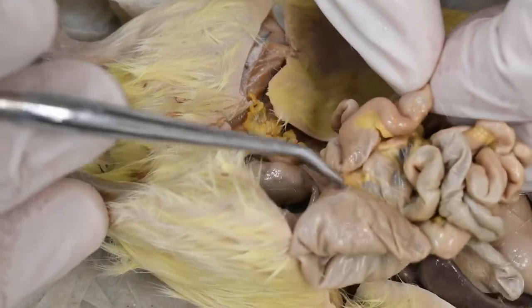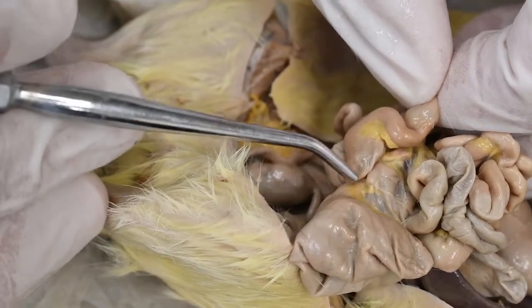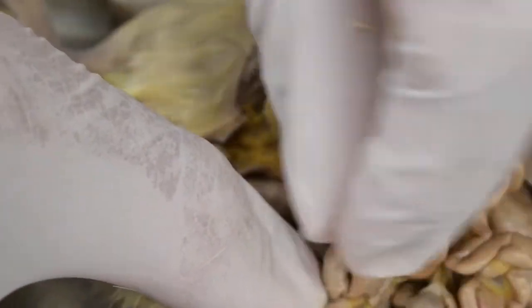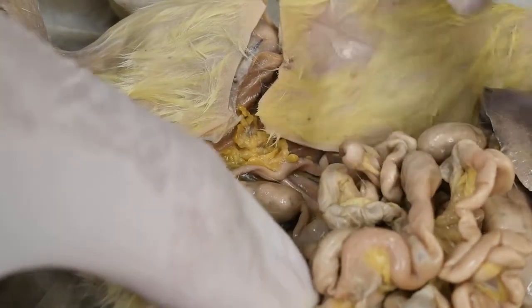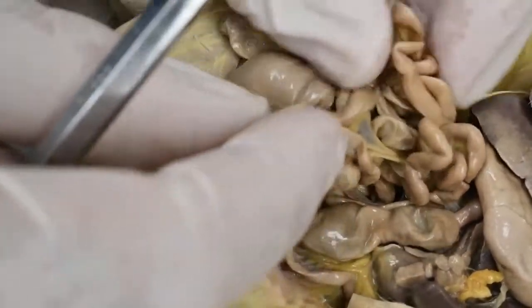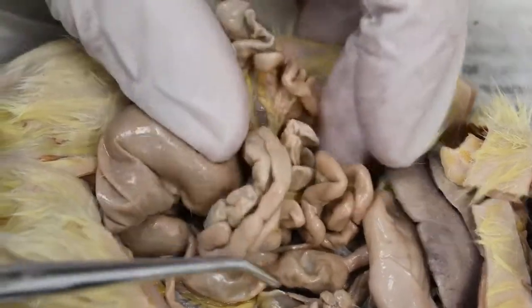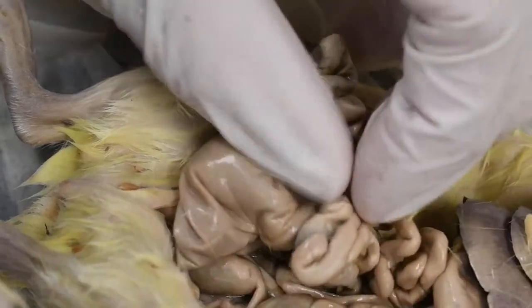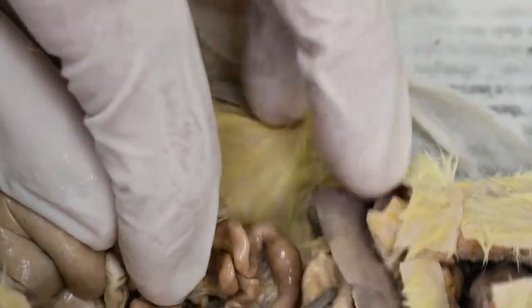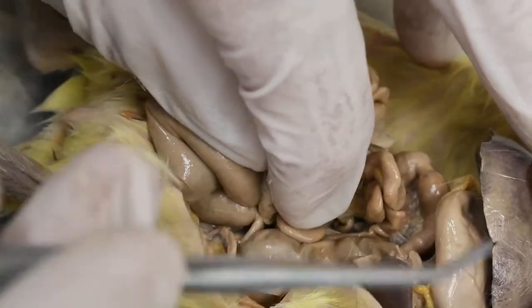And then you have, going in one direction, you have the cecum. Going in the other direction, you have what's called the ascending colon. So that's what that tube is right there. All right, again, it'll be easier to see in the specimen in the Practice Practical. So the ascending colon will go behind all this stuff. Again, like I say, kind of difficult to see, but eventually, you see this part here? Let's see if we can show you this.